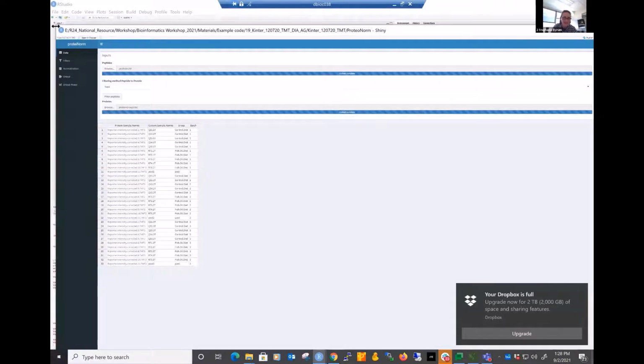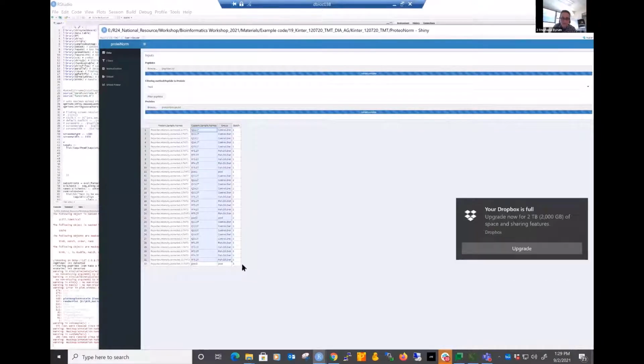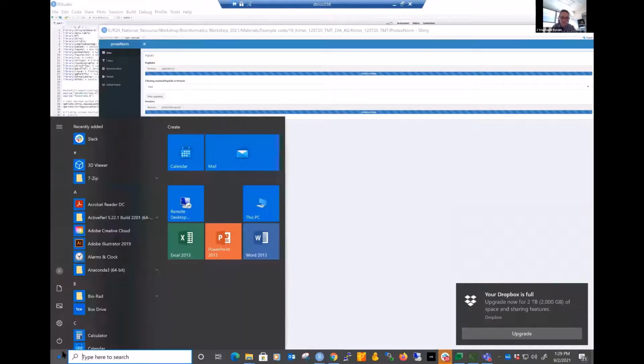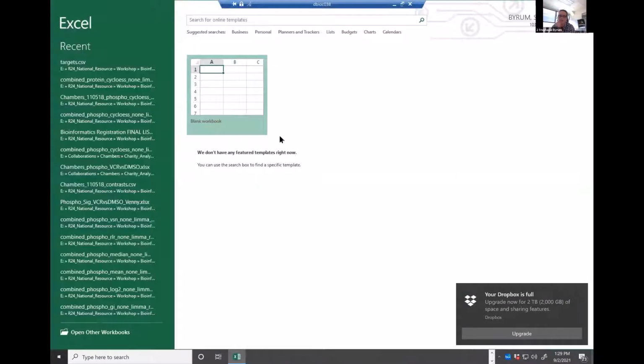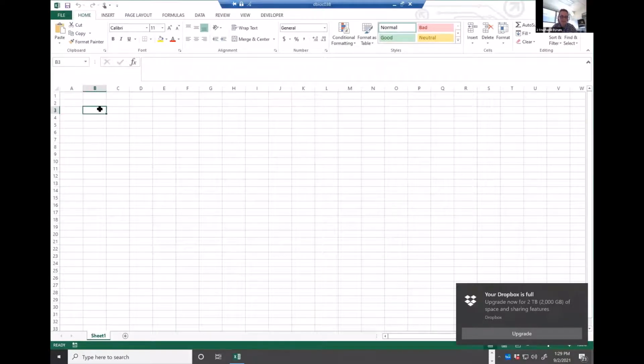Okay. I think I may have to rerun this because otherwise my fonts and things are not going to look very good. So bear with me just a moment. I am going to save that so I don't have to retype it. This is what you get with real live demonstrations. It's like, hang on a second.